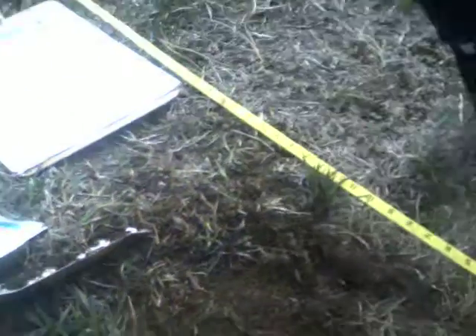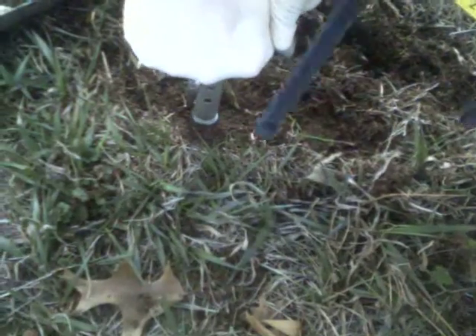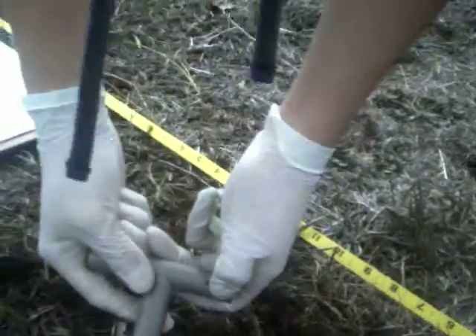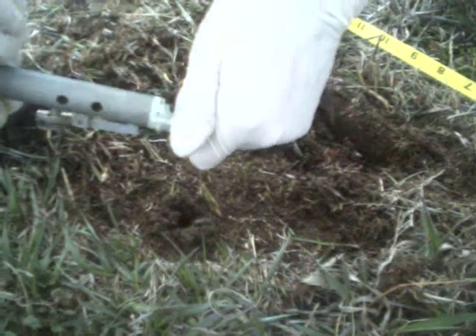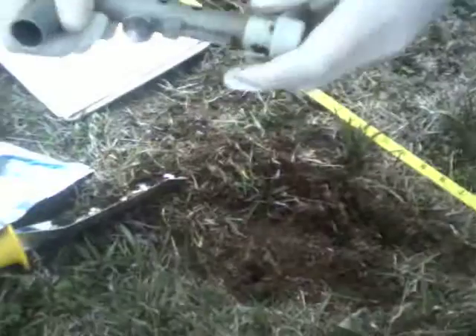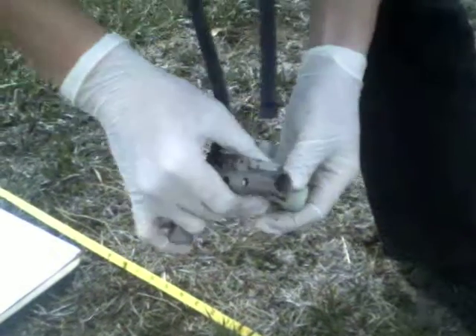So just push it straight in until that plunger is right in the middle. Put the cap on, and then it slides onto the edges and pops off.